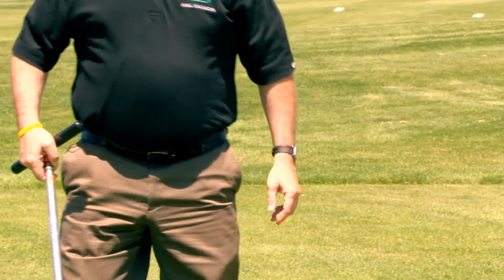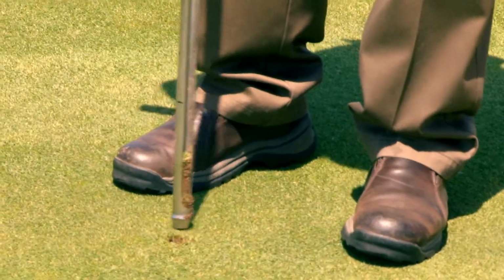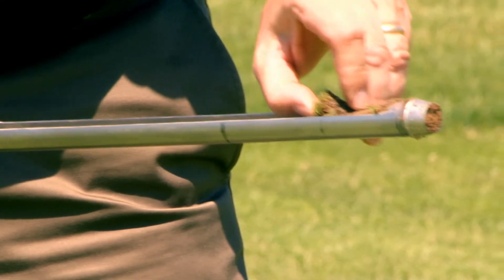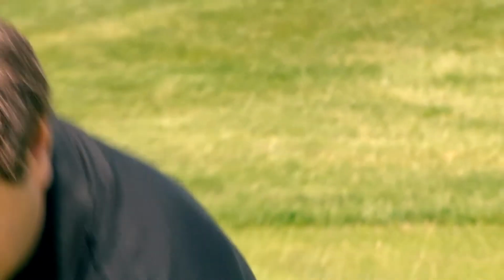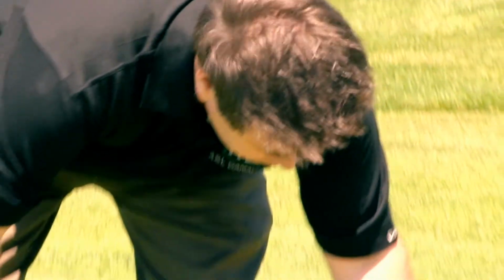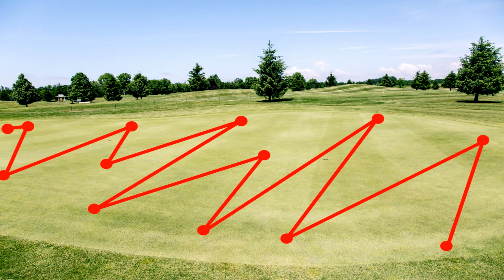So I'll just begin with the soil sampling, and you just want to push that probe in to, like I mentioned, that 3 inch depth. When I pull that core out, I want to remove that top bit of plant material, as we don't want that in the sample, and you can just use that to plug back into the green. Then just collect that sample in your bucket, and continue across the area in a zigzag M or W pattern.